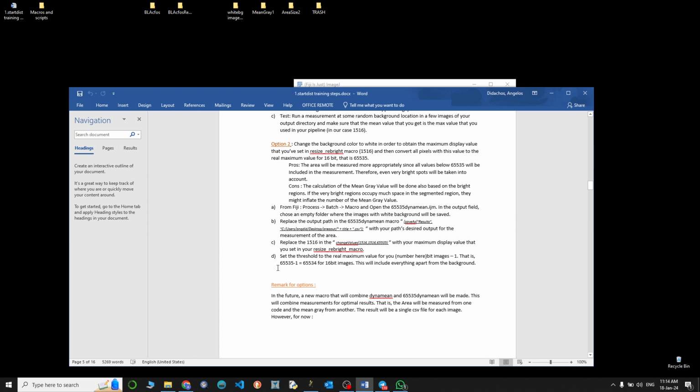After we do that, we will create a mask to separate our segmented part from the background, and we will practically include everything which is -1. This way, we're reducing the risk of miscalculating the area size. It's way more precise on some occasions. In others, it doesn't really play a role. But it is safer to go that way, and you should go that way.